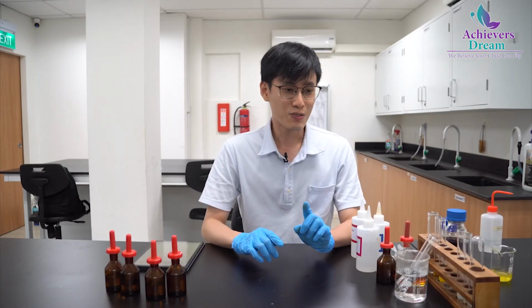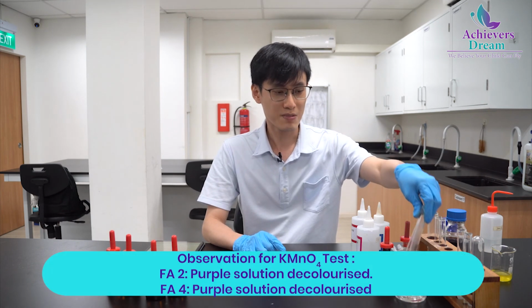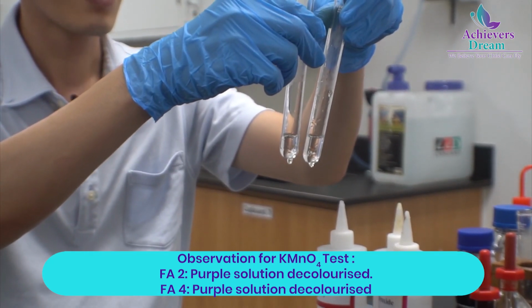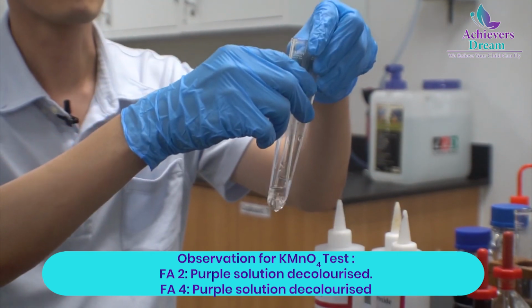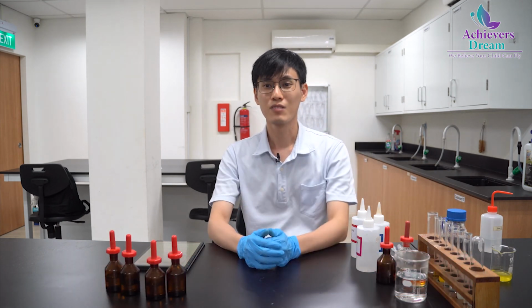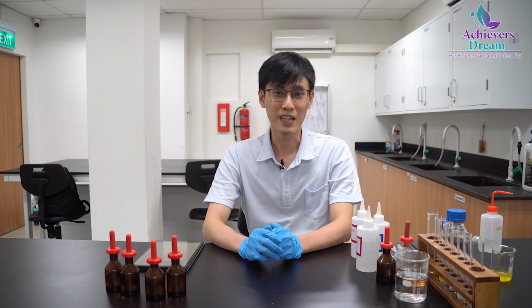So now let's do a quick check on our KMnO4 test results. Wow, so both solutions have decolorized, the one for Fa2 and the one for Fa4. Okay, so we are done with part 4 of experiment 9. Thank you.